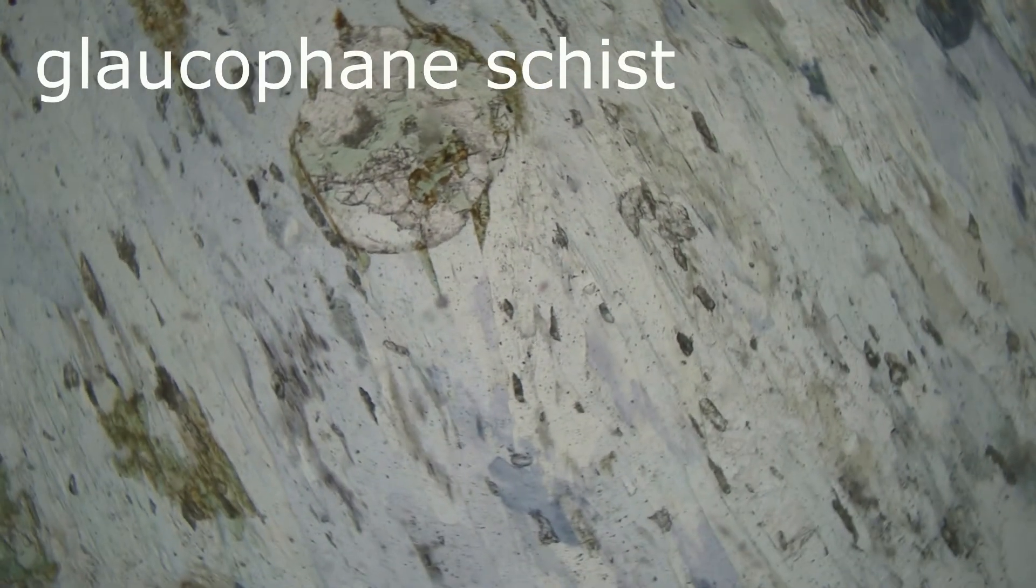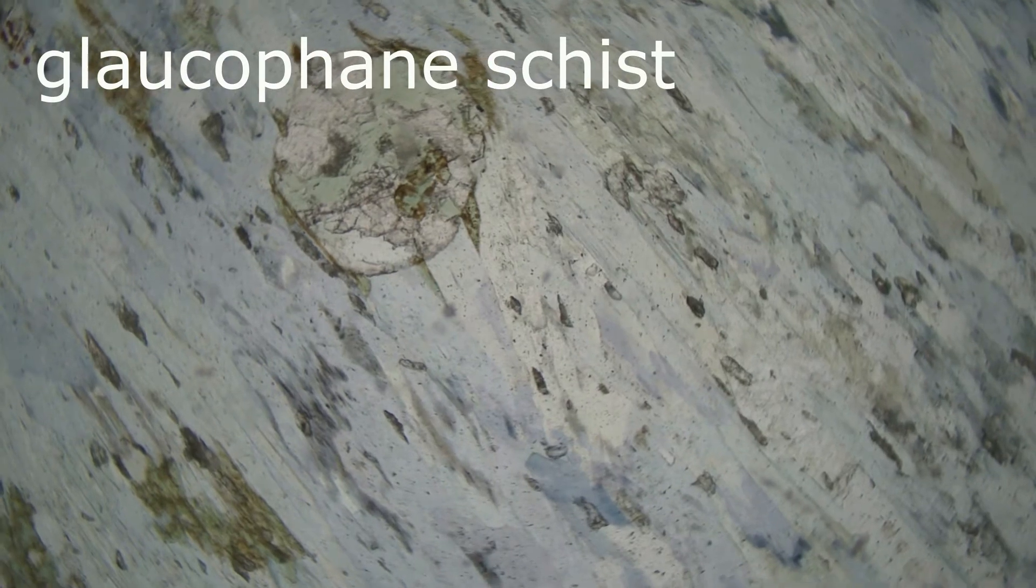This is a thin section of a glaucophane schist. Glaucophane is a blue amphibole, and in thin section, it shows pleochroism involving various shades of blue, violet, and purple. The color change with stage rotation in this sample is quite subtle compared to the biotite we just looked at.